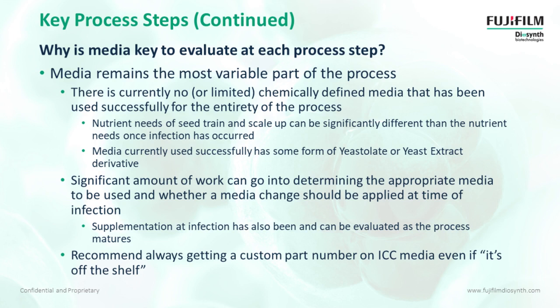And a lot of work can go into determining what that appropriate media is. Some companies will change media at the production stage or add media components and that sort of thing.